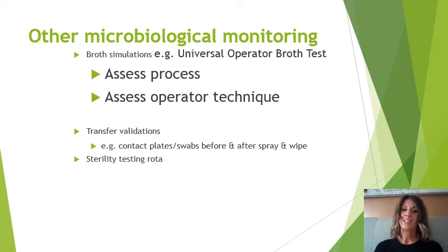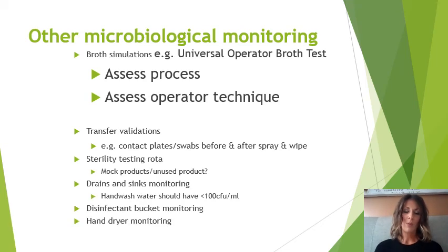We also should have a sterility testing rota, so sterility samples should be produced and retained and then sent off for sterility testing. This is another, we sort of moved away from sterility testing slightly, but that will be coming back into focus. It should be a combined monitoring schedule that complements the end of session broth fills. With sterility testing, there's a discussion whether we should use unused products, so waste or returns, or mock products. We used to fill saline bags, literally withdrawals of saline, and send that product after we've manipulated it off for sterility testing.